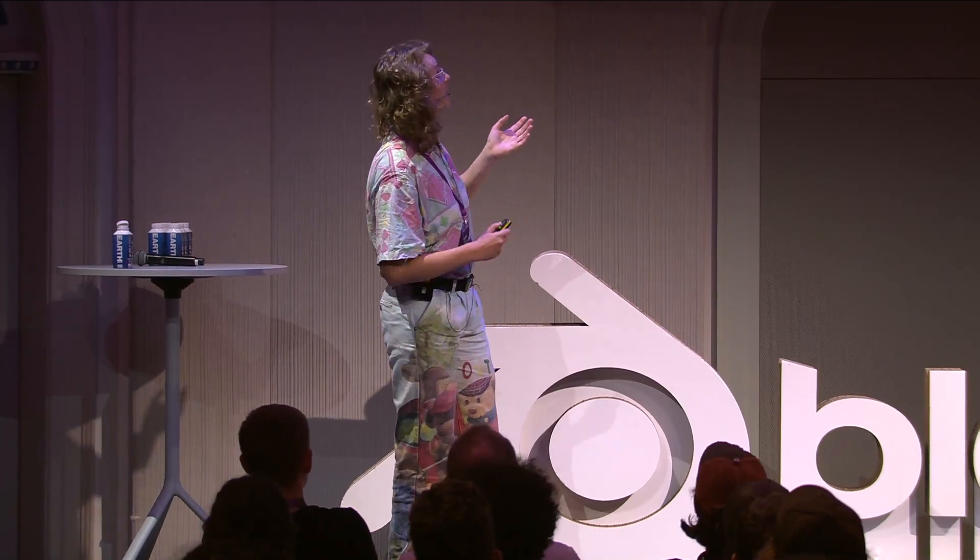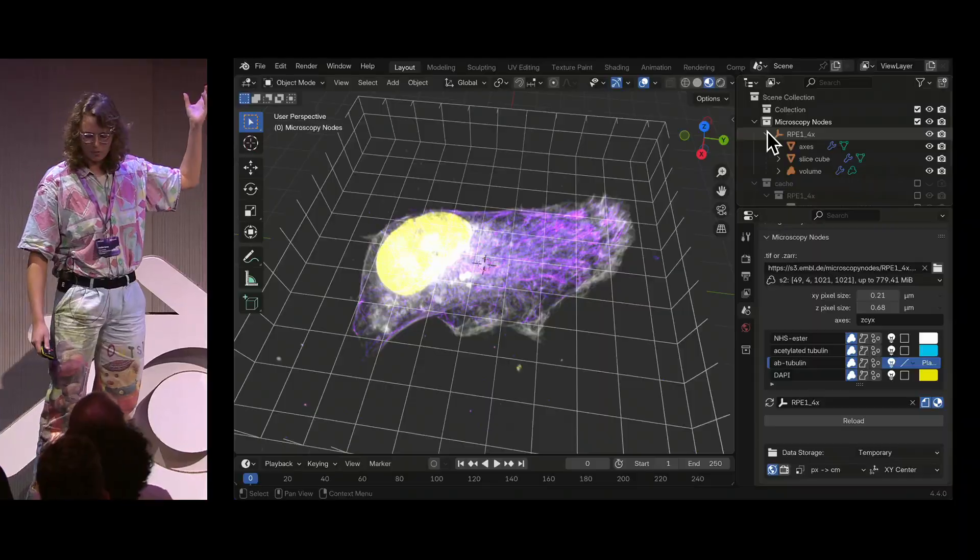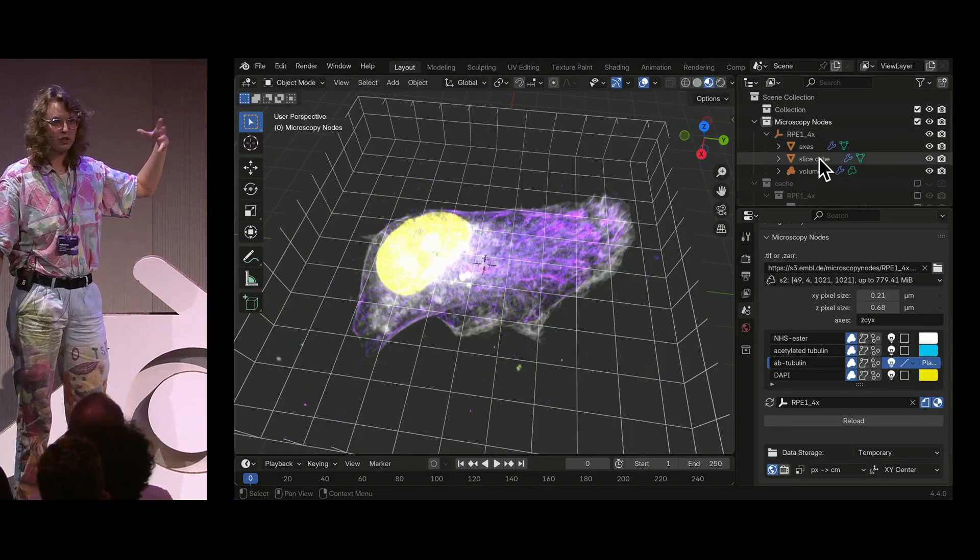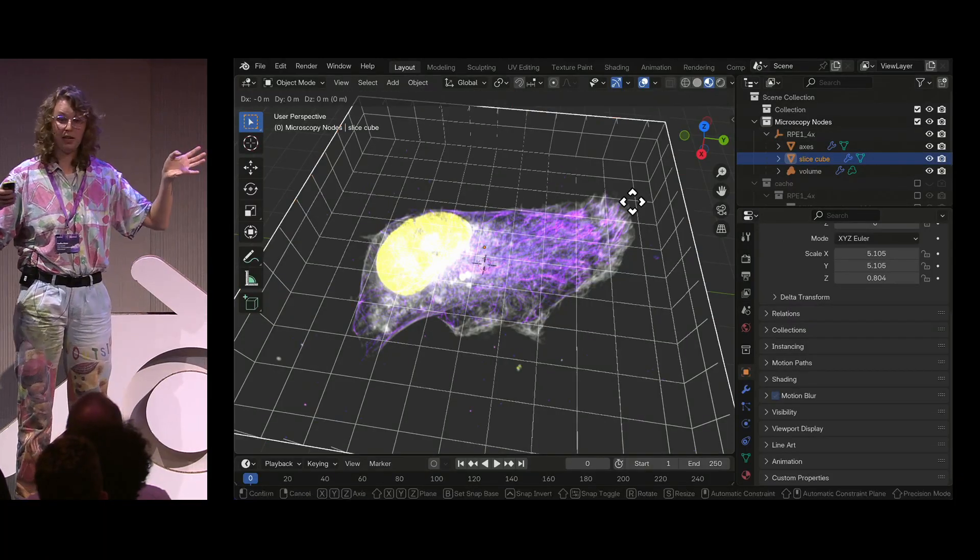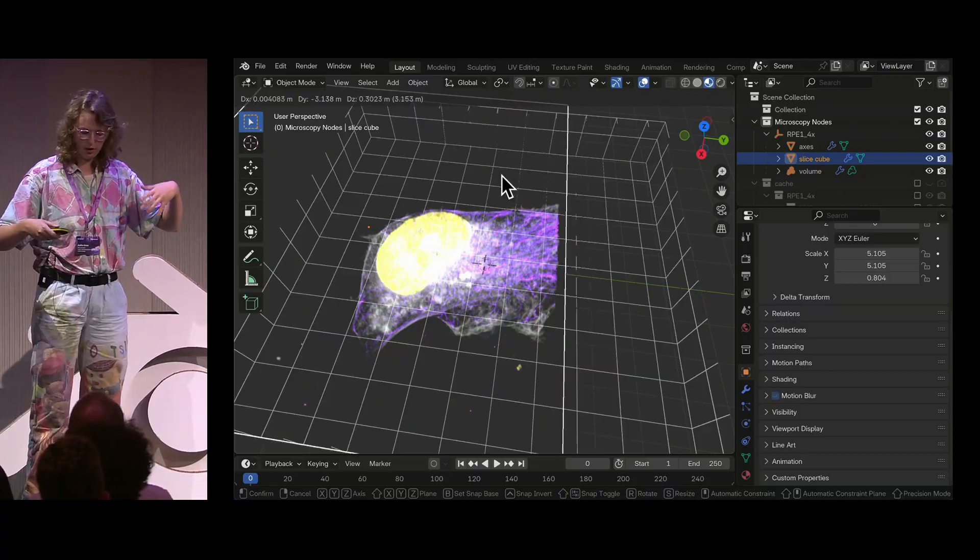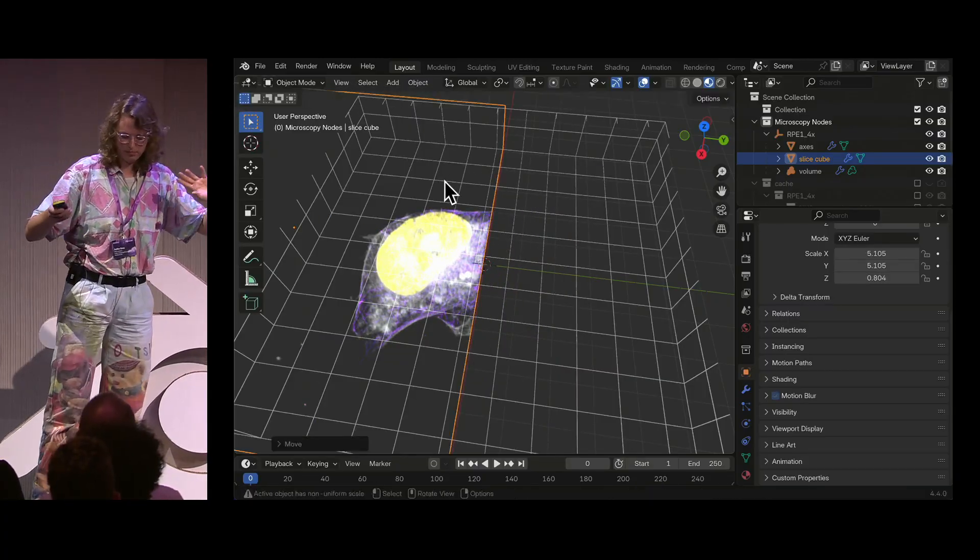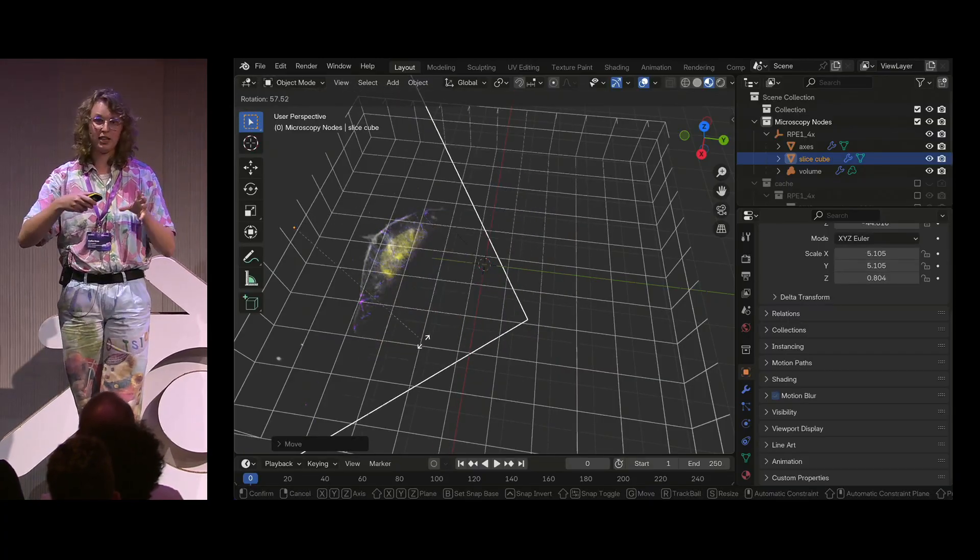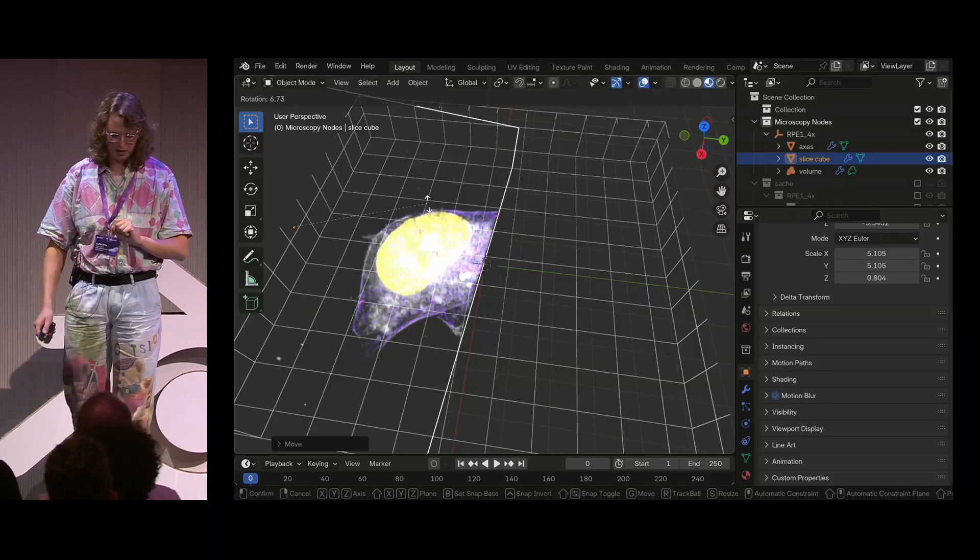So what we've actually loaded is this holder with the axes, as I explained, a slice cube, which is a cube that just modulates the visibility of all the volumes, so you can rotate, scale, and whatever this. And you can also actually make multiple slice cubes and make an interesting array with that.